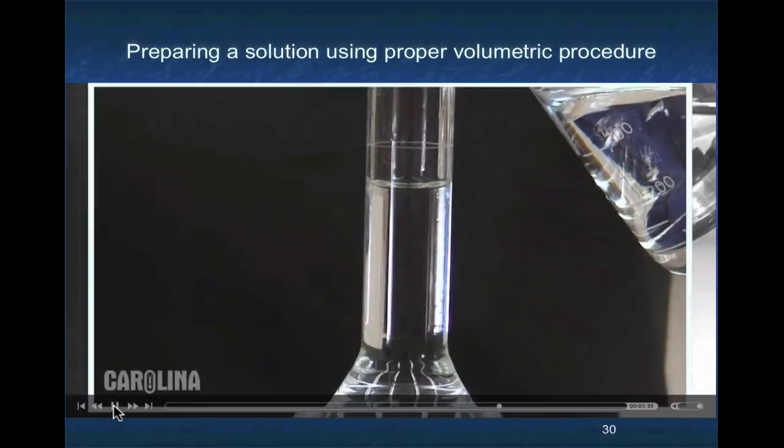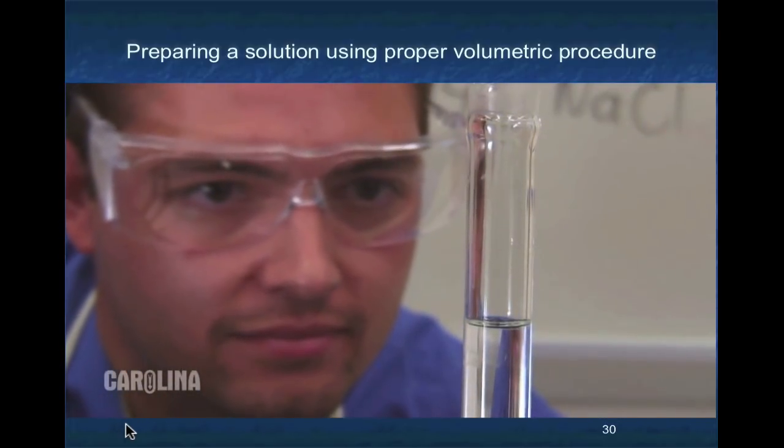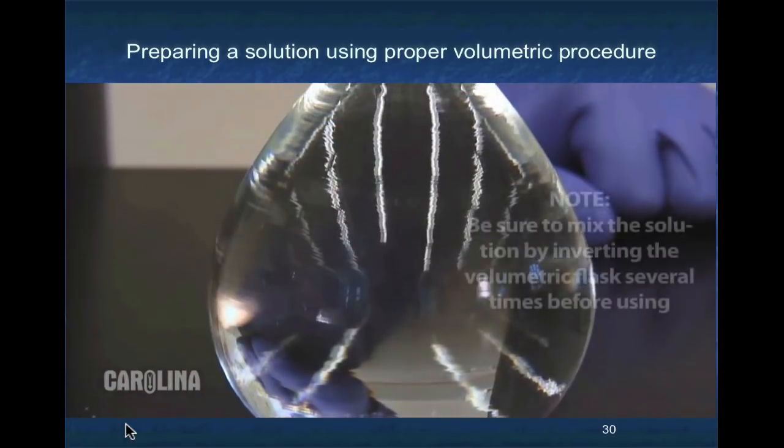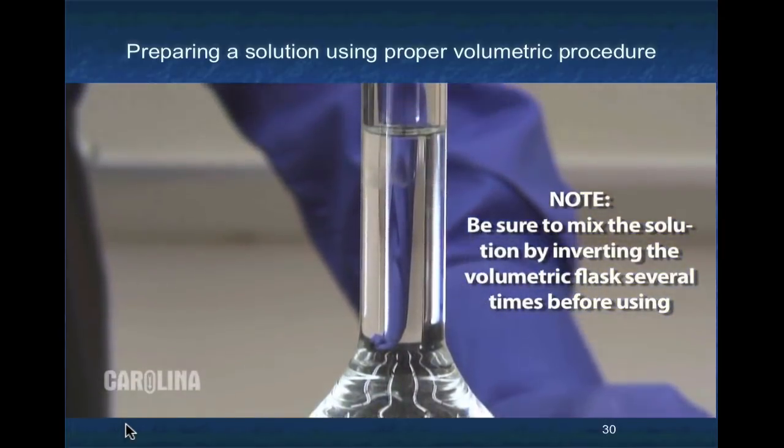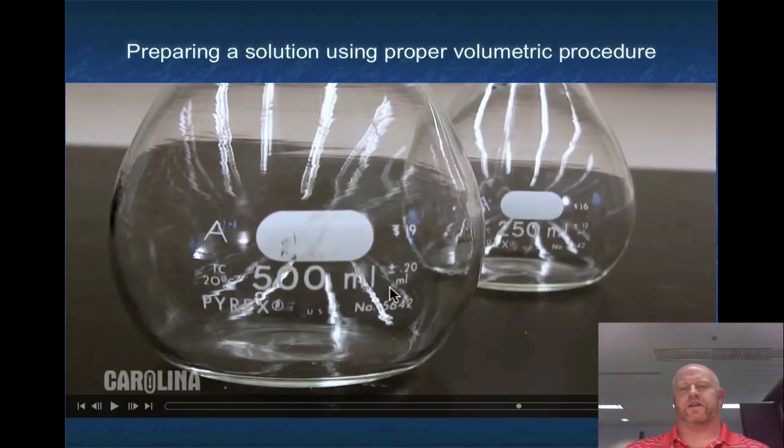This phenomenon creates what is called a meniscus. The bottom of this curved meniscus should sit directly level with the line on the flask. At this point, there is exactly 500 milliliters of solution, with an error of 0.2 milliliters. Notice here that it shows the error value, plus or minus 0.20 milliliters. Also notice how it says 20 degrees Celsius. What they're telling you is that this volumetric flask is only standardized at 20 degrees Celsius. So if you're working in a much hotter environment or a much colder environment, the expansion of the glass itself would throw off the volume and would not be accurate anymore.